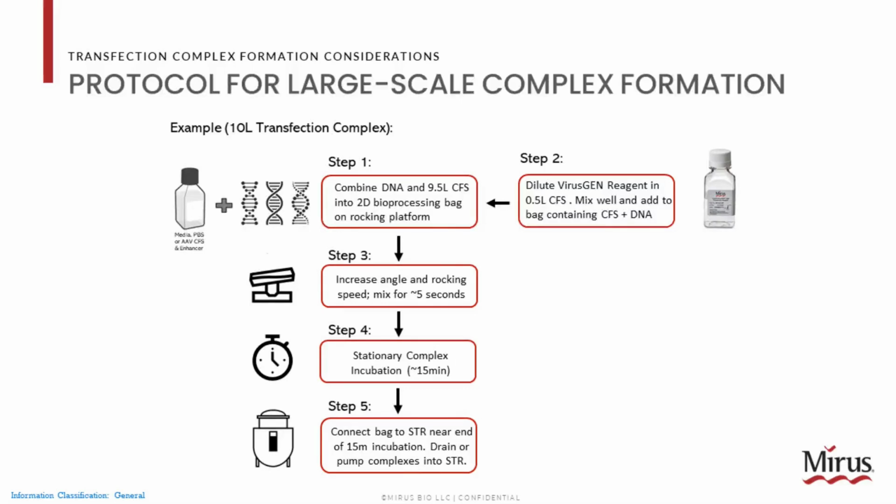Of note, and a question we do get from time to time, is pumping versus gravity draining. As long as your pump isn't aggressively pumping at high speeds or high pressures, the shear force that the complex will see for most pumping is not going to be too harsh to damage the complex. Certainly figure out what is best for your process, what works for you, and either one will be able to be used with VirusGen.